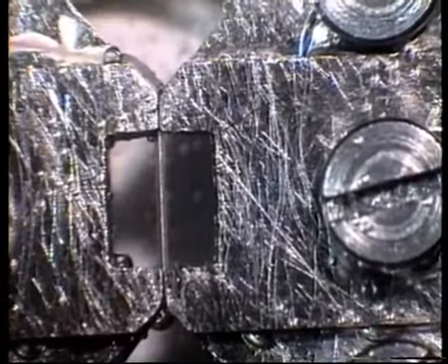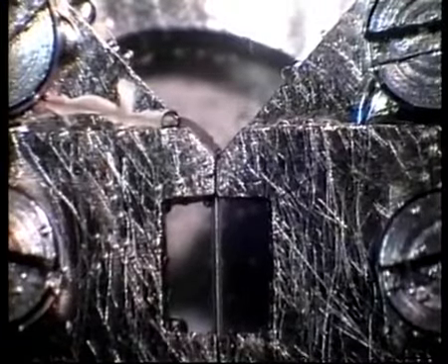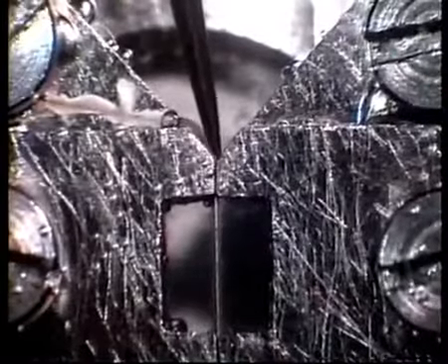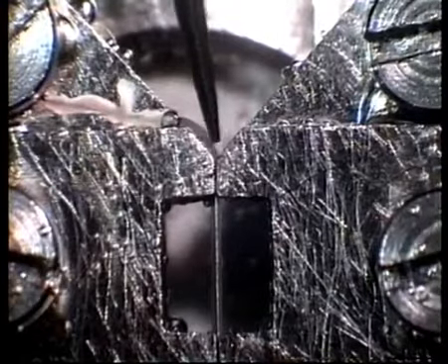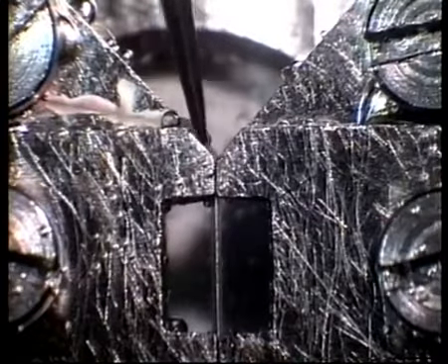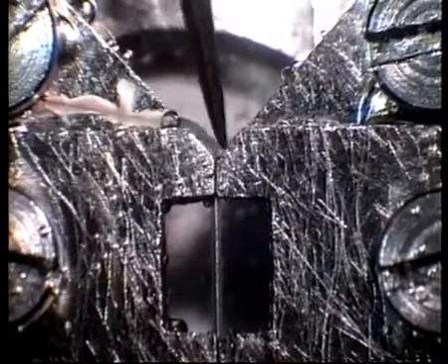To get a second wire into the lumen from the top end, you need to remove the part of the vessel that is not in the gap between the jaws. This can be done in two ways. The first way, which is shown now, is to close the jaws and use a pair of forceps to rub the tissue away. The part of the vessel between the jaws is fairly secured when using this method because the heads are together.